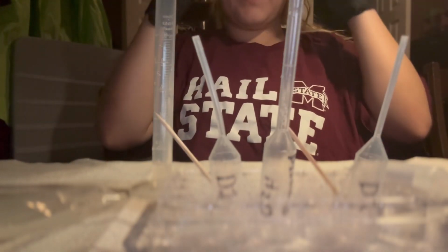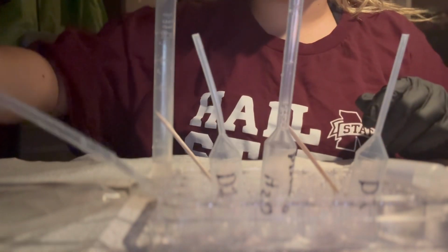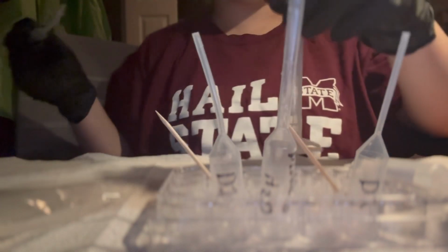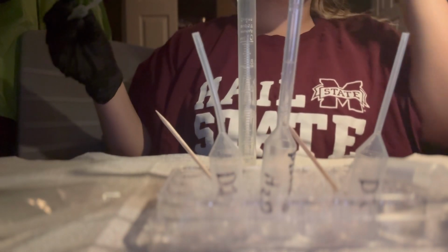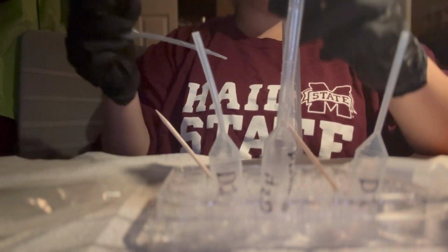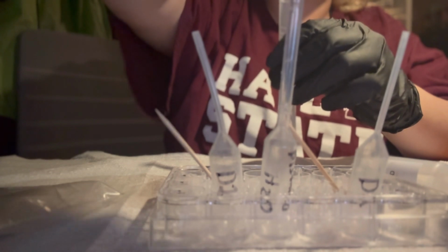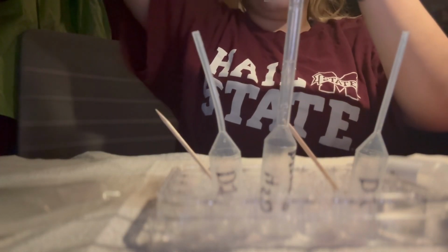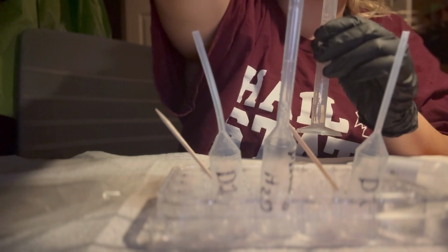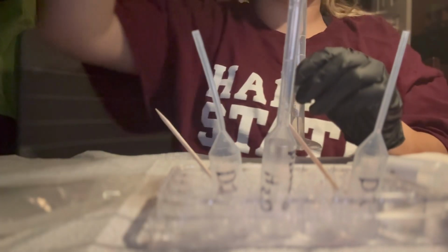So here's the setup for the experiment, and now we will be measuring 2 milliliters of vinegar into wells A1, A6, B1, and B6. We will be using this to measure 2 milliliters of the white vinegar from my bowl. I've already done well A1, so now I'll be doing well A6. That is exactly 2 milliliters of white vinegar. Now I'll put this into the well.